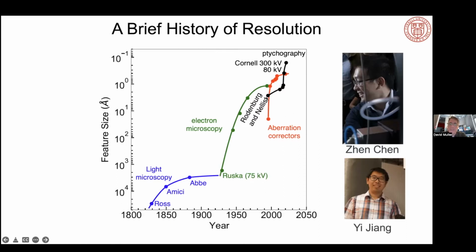And the problem with ptychography at the time was, because the detectors were not very good, this is underperforming what you could do on a top-end instrument or on an aberration-corrected instrument at the same time. So ptychography ran into 2 problems with electrons. One is the electrons are very strongly scattering, so you're very limited in what kind of samples you could look at. And the second one was the aberration correctors were already doing pretty well. So without the detectors, ptychography wasn't competitive.